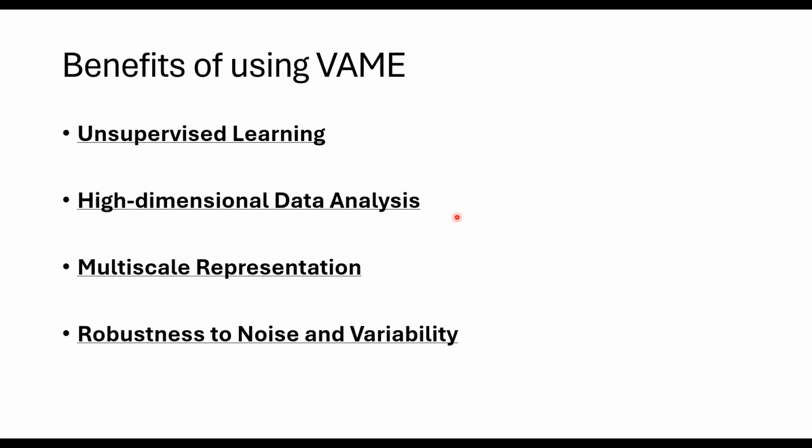Next, high dimensionality data analysis. This approach is very powerful. The variational autoencoder based approach enables analysis of high dimensionality behavior time series data, which is challenging to analyze using traditional methods. And this platform provides a very easy to follow tutorial on their GitHub as well.